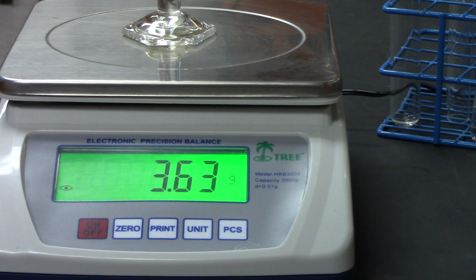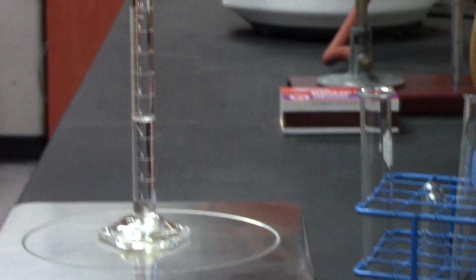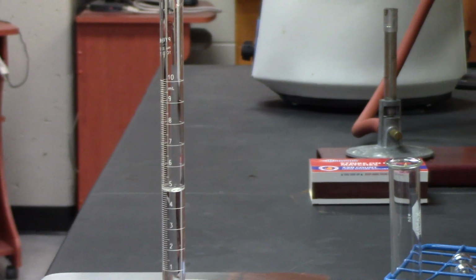Okay, so what I need to have you do is record this value right here, its mass, 3.63 grams. Okay, now what we have to do is measure the volume. So we're going to zoom in as close as we can get.